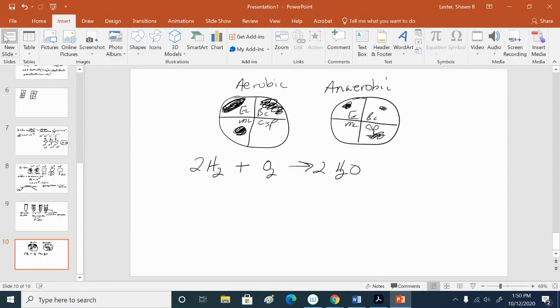Methylene blue indicator strip, right? Remember, the methylene blue is only blue with oxygen. Without oxygen, all the blue color fades away, and all we see is the white paper behind it.